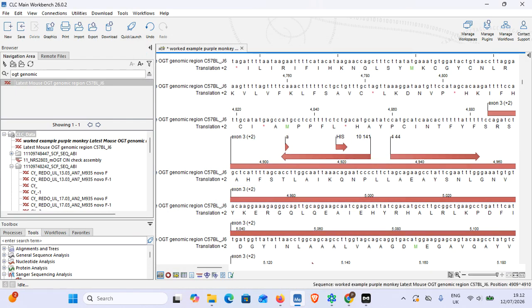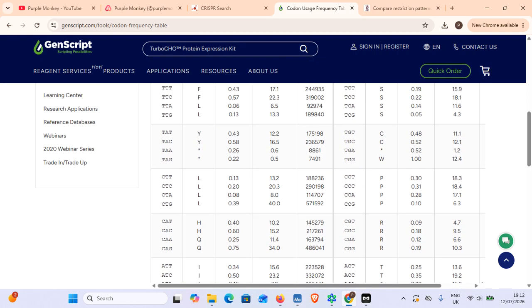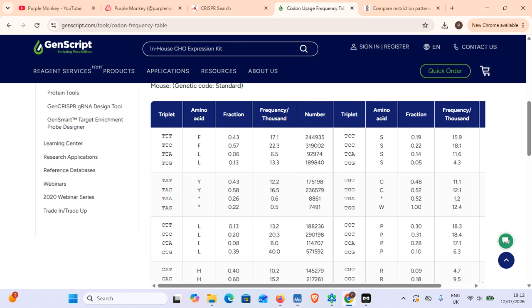So I know in my last video I said PAM killer plus 2 changes, but I'm rarely that conservative, but in this case, because His is dancing in the thing as well, let's see what we can see. So, TTG for leucine, if my amino acids are up to date. So, TTG, where are you in this table? I know this seems tedious, but trust me, the payoff is huge. Okay, TTG, L, but this is one of the codons where there's not just 2 over here, there are 4 over here. So we get to get a bit cute.